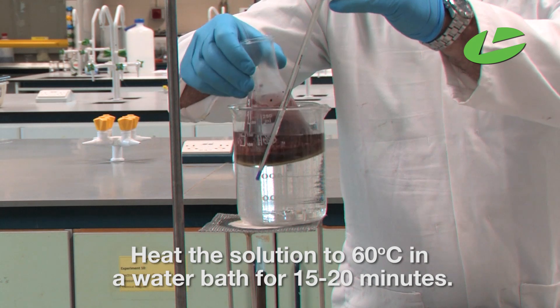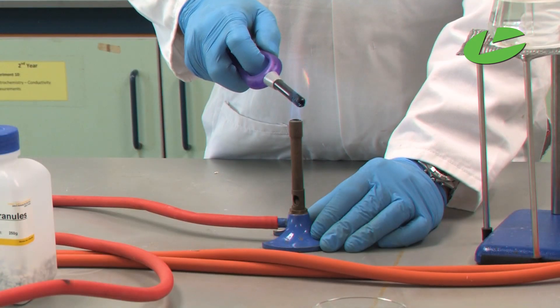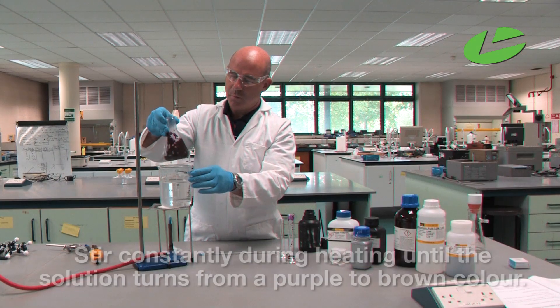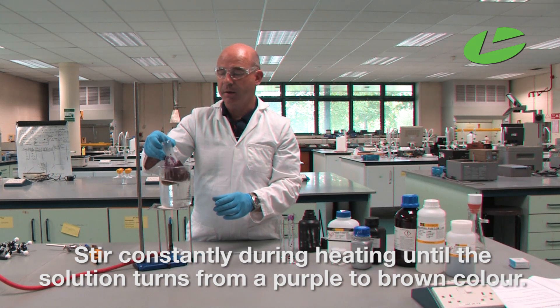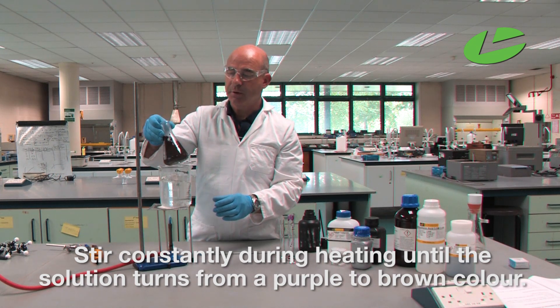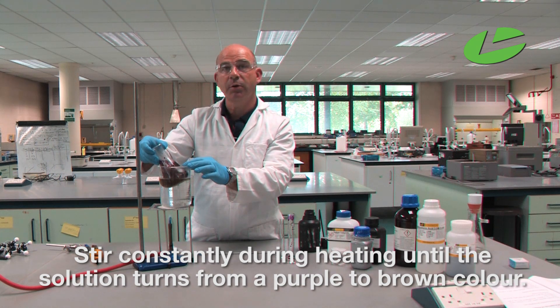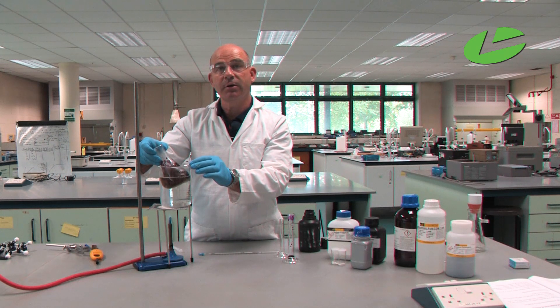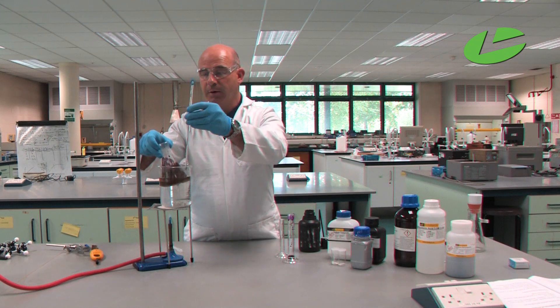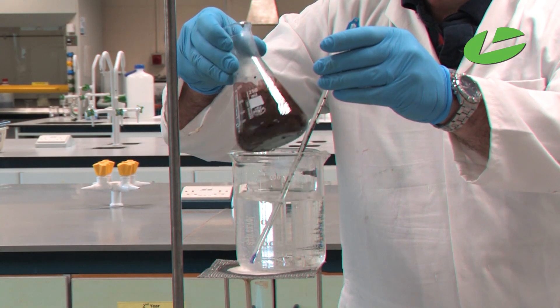This reaction mixture has to be mixed for 15 to 20 minutes at 60 degrees Celsius. I'm going to place it on top of my water bath and then turn on the Bunsen burner. With constant stirring, let the potassium permanganate oxidize the benzyl alcohol. You may notice the brown color of the potassium permanganate coming out — that shows the manganese is turning from +7 to +4, indicating it is oxidizing the benzyl alcohol.